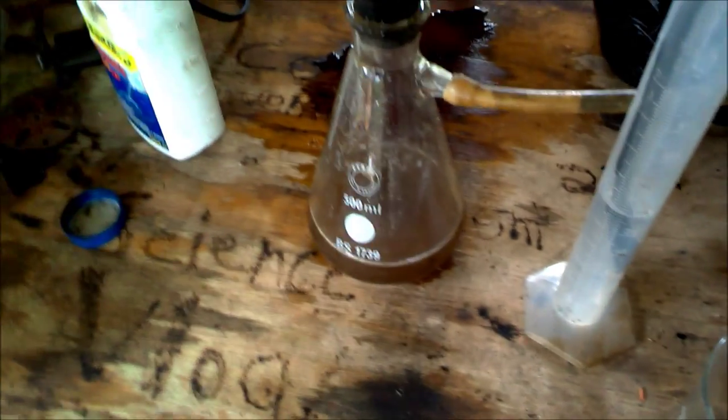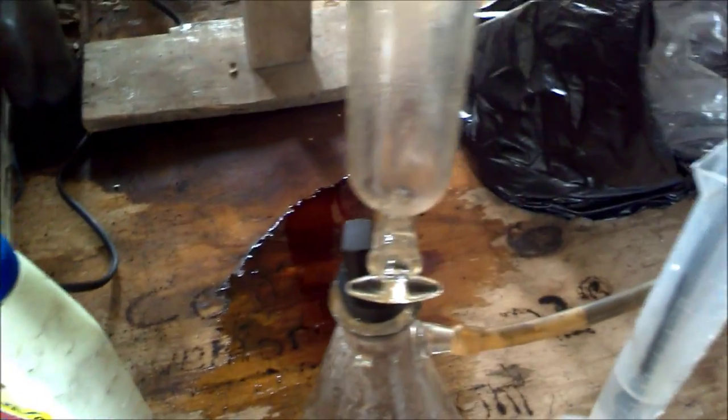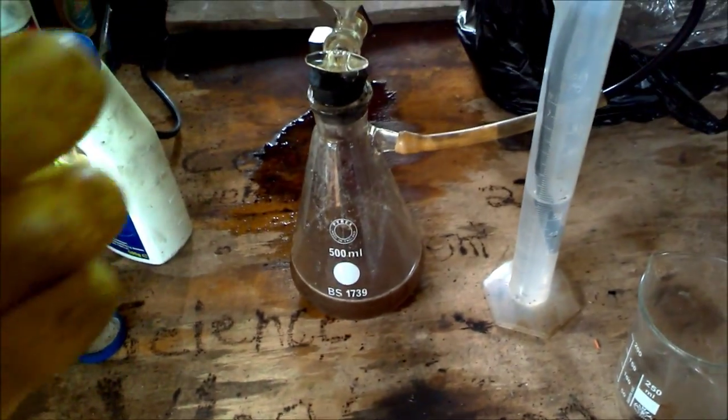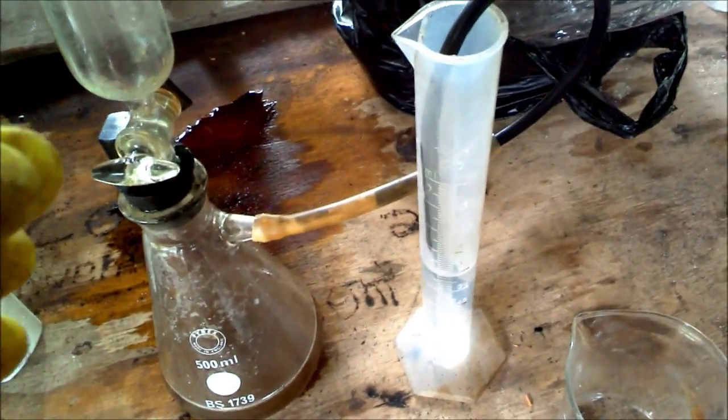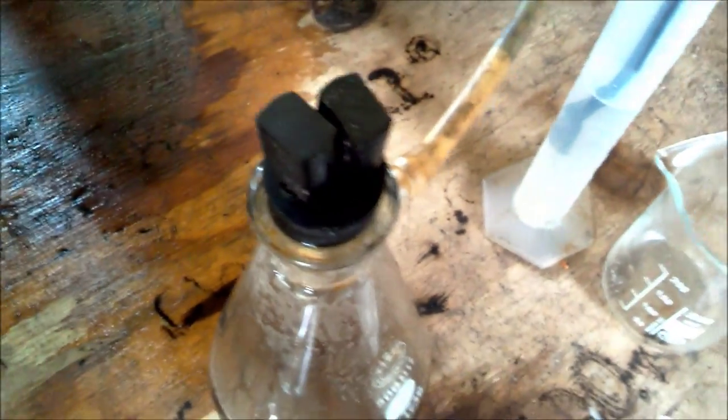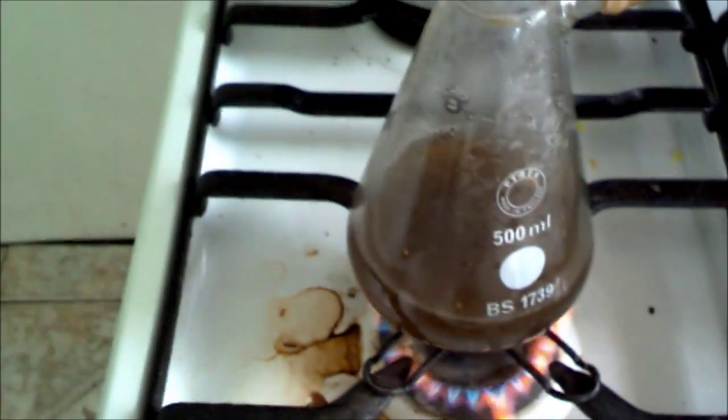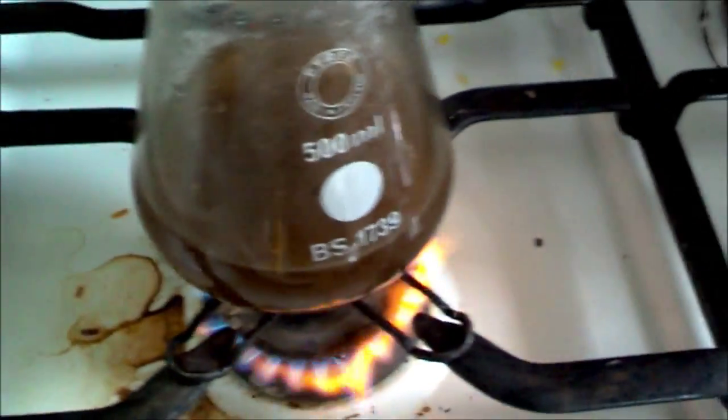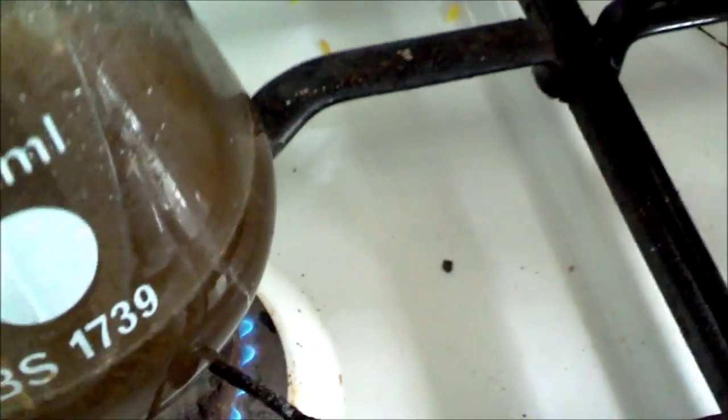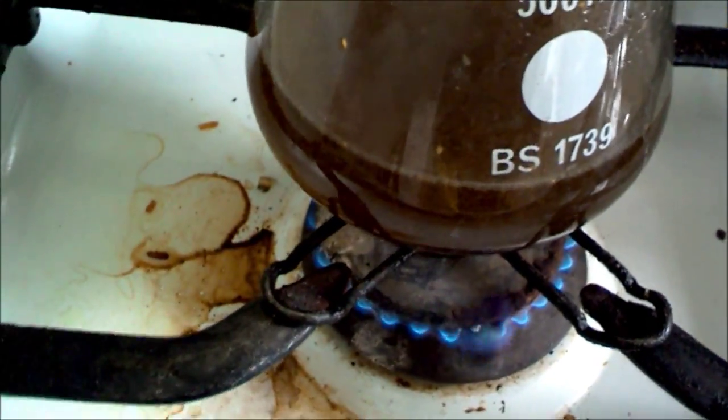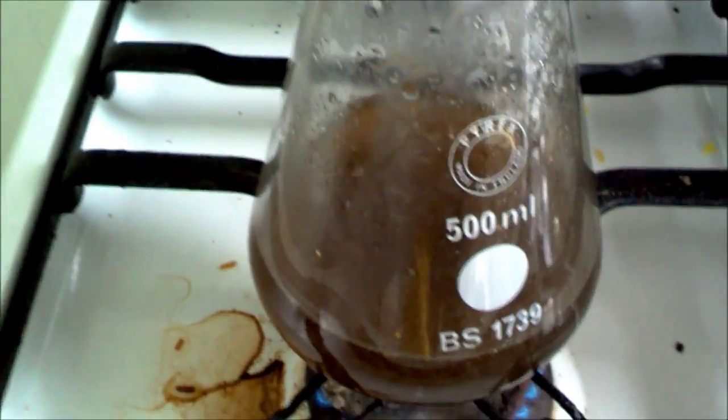Once the addition is done, remove the flask and replace it with a stopper, and then you'll have something like this. Next you'll need to heat the solution. As you can see, the ammonia started generating again. Continue the heating until the bubbles subside.